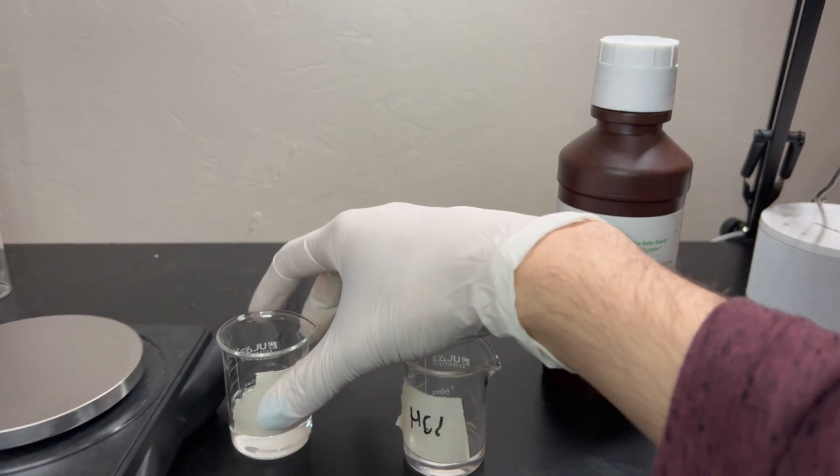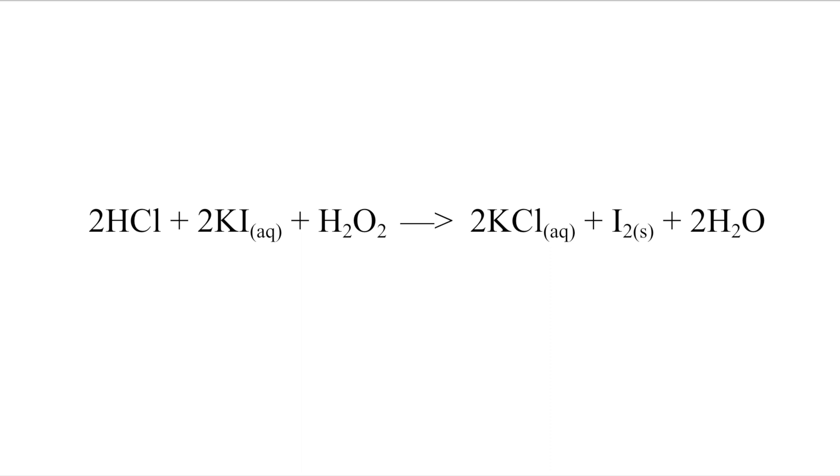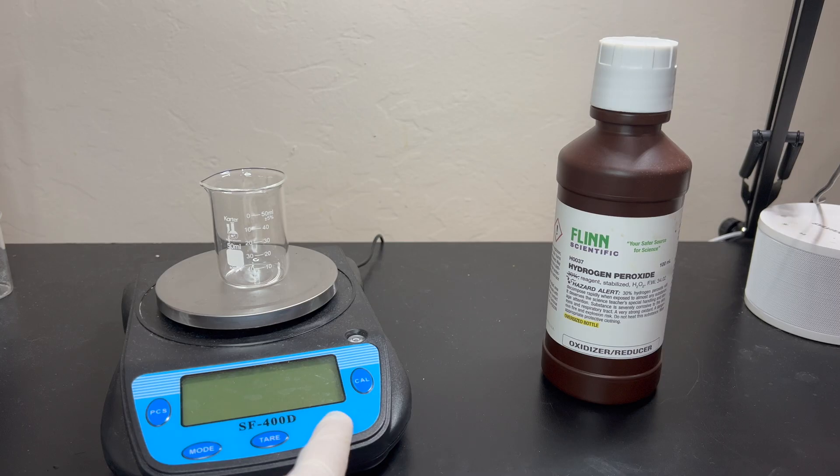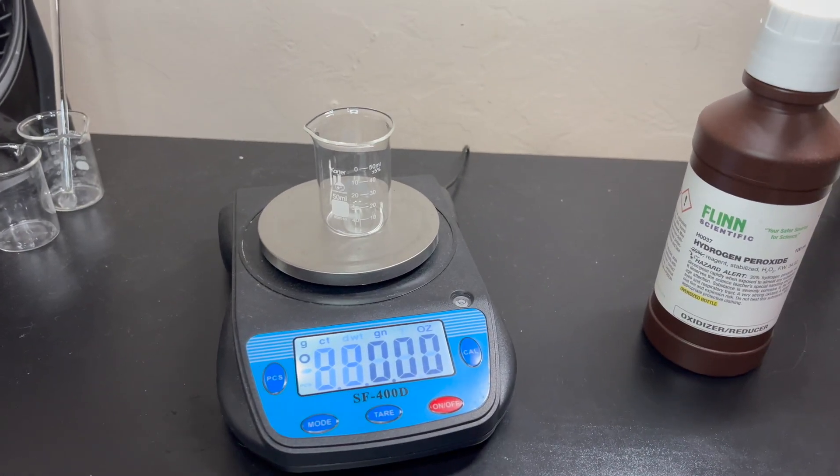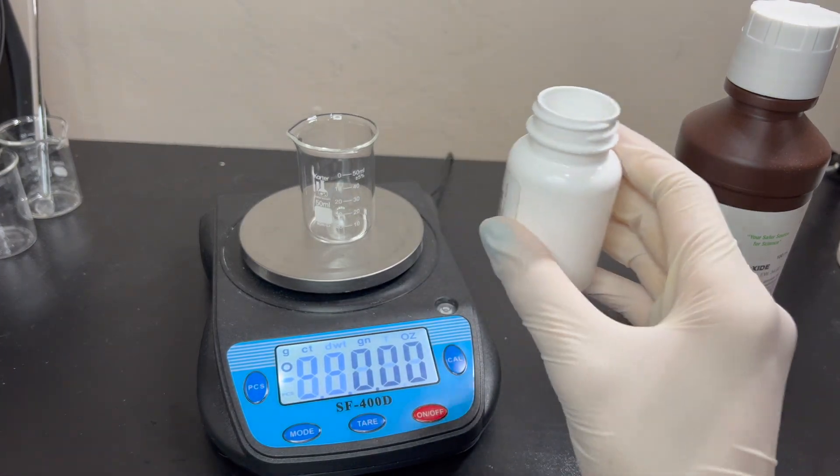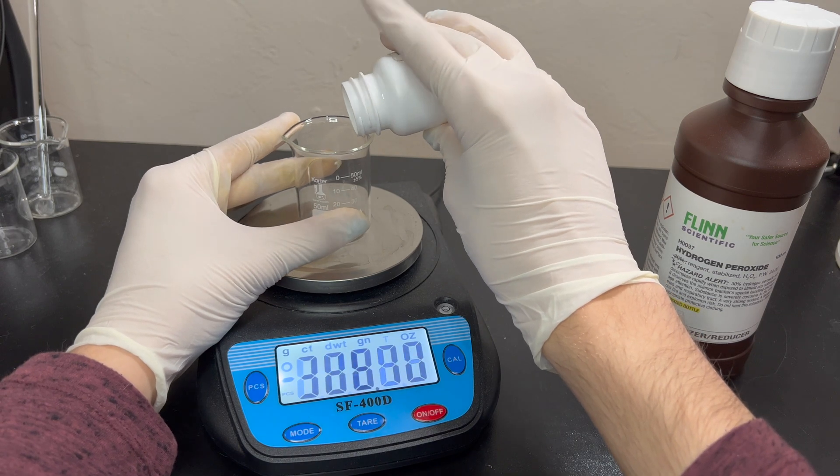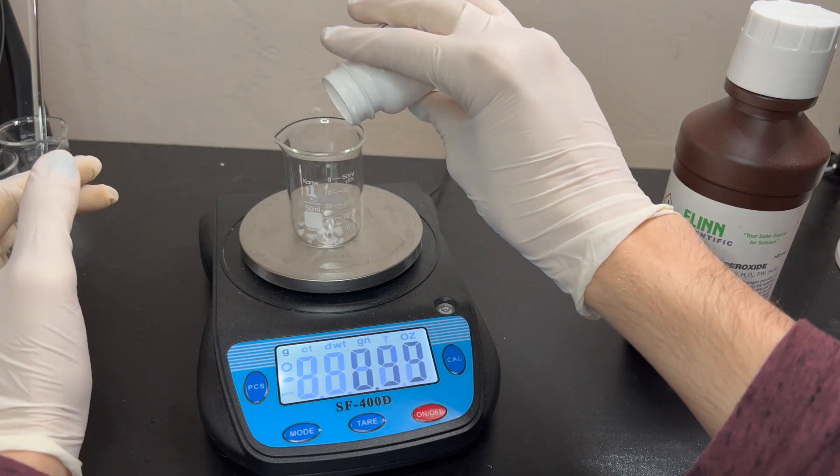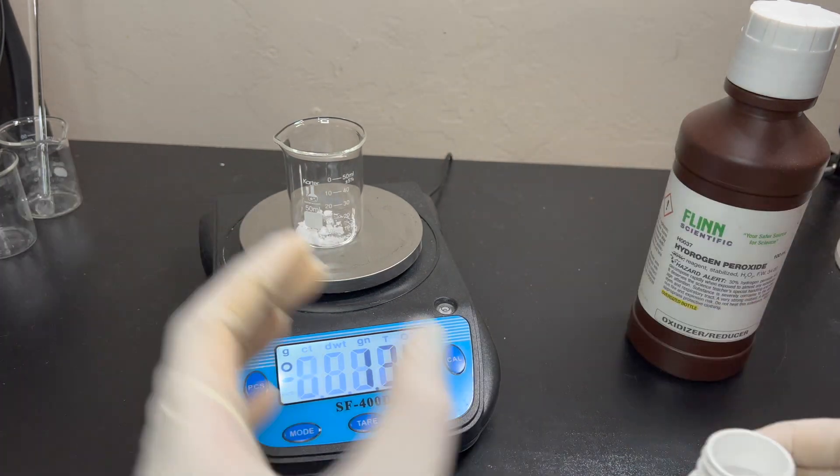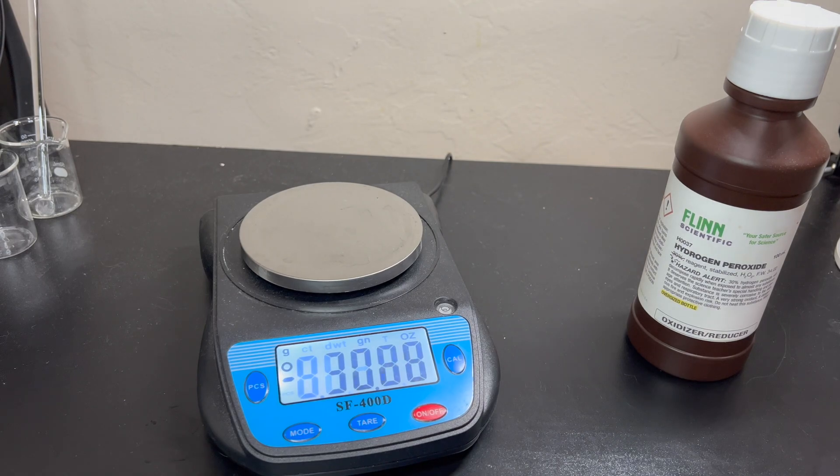So, the way we start is we start off with weighing the amount of potassium iodide. And this is all based off a formula that I will put on the screen now, and I will go into more detail on how that works later in the episode after we actually make iodine. So, get your scale, go ahead and zero it. Mine automatically zeros when I put something on first. And I'm going to do about 1 gram of potassium iodide. And this should yield not a whole lot, actually, of iodine. Only about 0.7 grams based on the formula. Just based on their molecular weights, it's just not going to produce a lot of iodine.